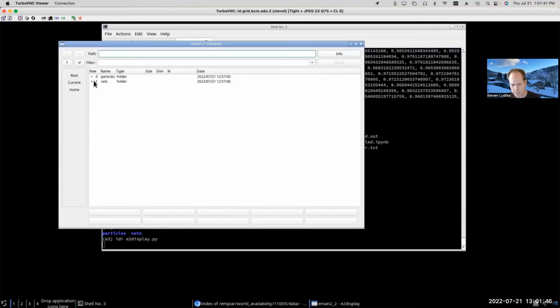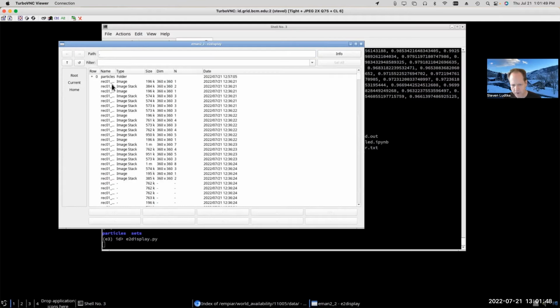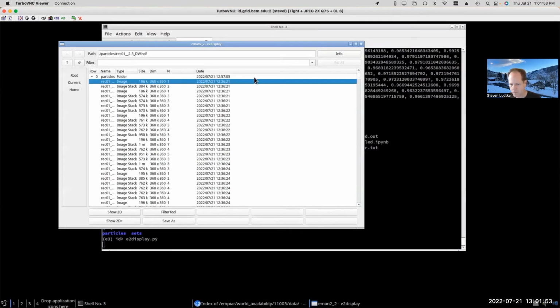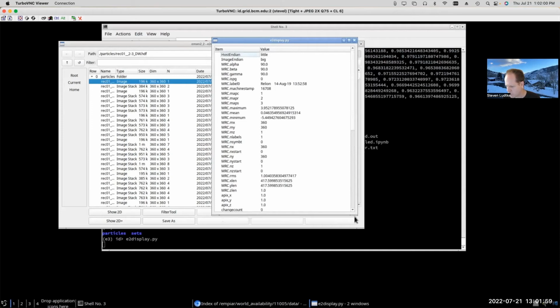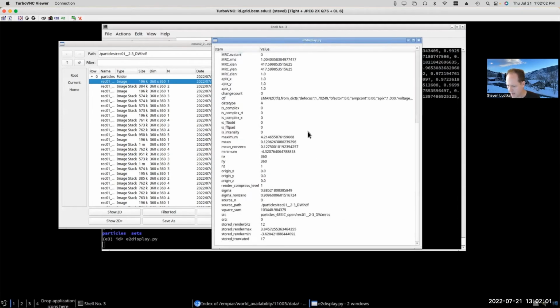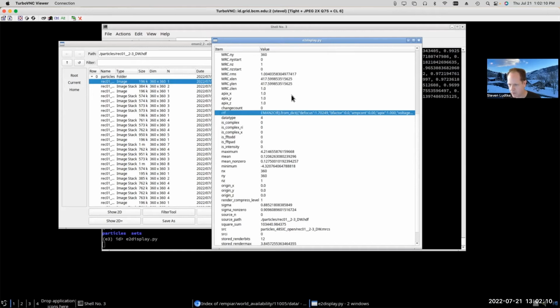And if we look at particles, we will see this massive list of particle images. If we pick one of these, info, we can see all the header data which was stored for this particle. And we can see that it has the CTF information that came from the star file, and all the other parameter information.